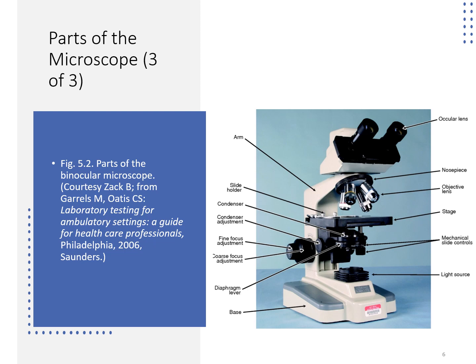So you want to focus on learning the various pieces of the microscope and what those areas are called, because we will refer to these when we're working in the student lab.